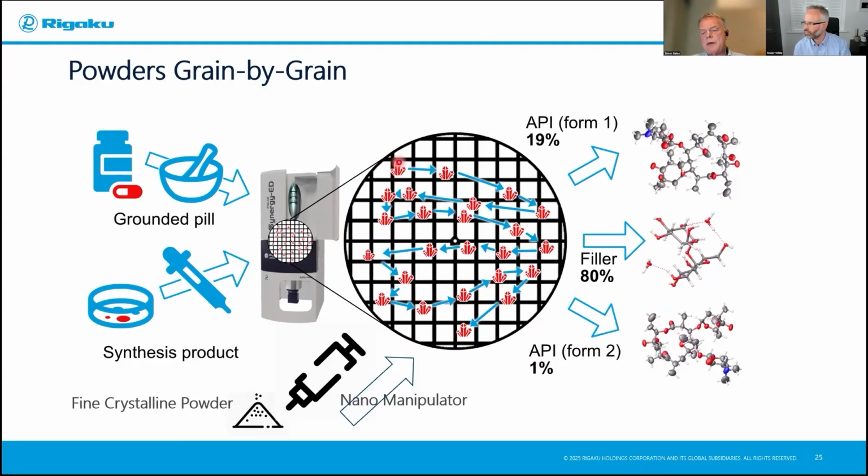And then the automation pathway, at least in the Chrysalis Pro pipeline, steps through each grain automatically. It'll align the grain into the electron beam. It'll do the first pass. Does it diffract? Is it crystalline? Second pass through multi-grain, multi-images. It'll then extract the index solution. Then we can choose to combine data together for the same unit cells and go into connectivity. And if needs be, we can then go into absolute structure and look into placing protons and the rest of it. This is like a flow pipeline through the automation process itself.